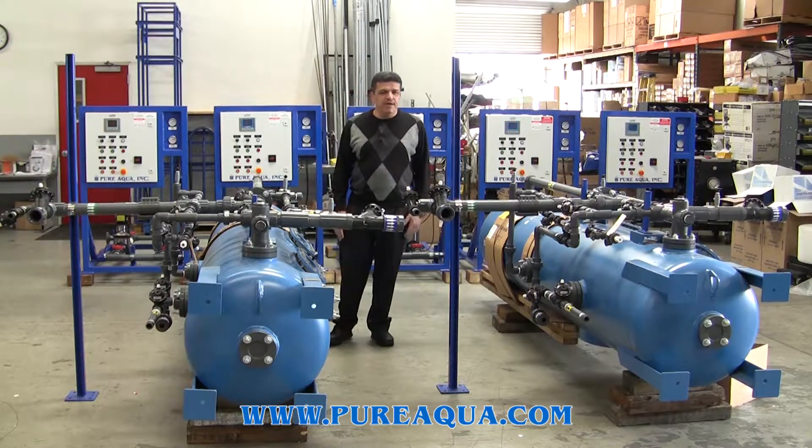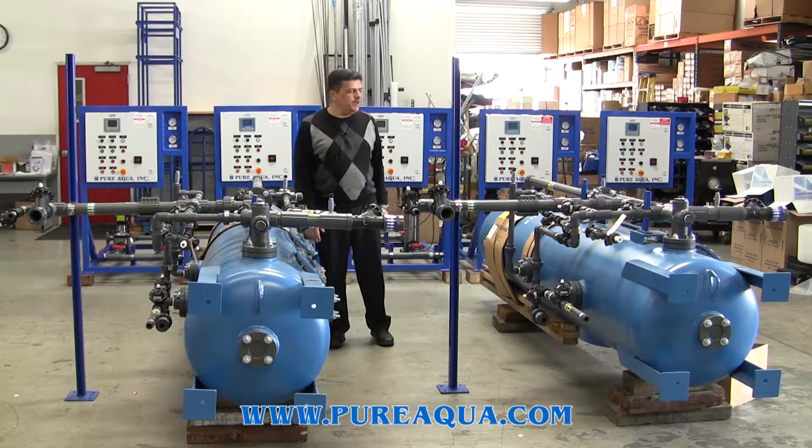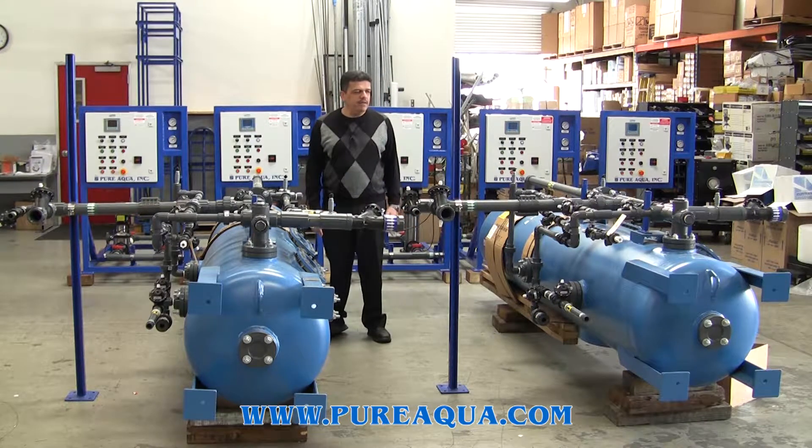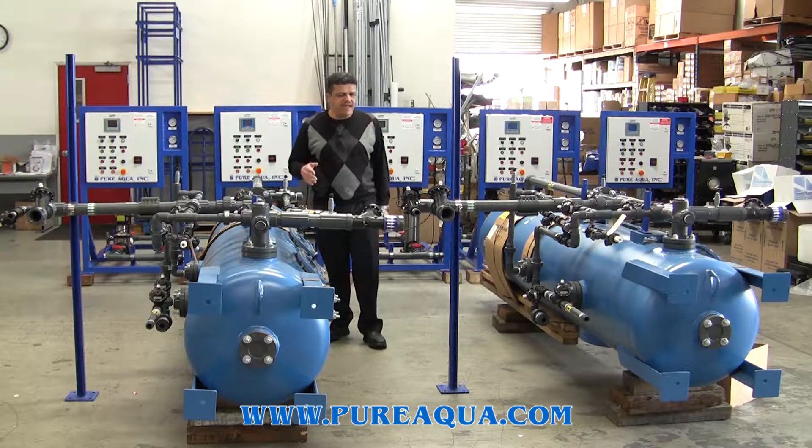We are here to ship a shipment which is going to Kuwait today for a major university in Kuwait — a mixed bed deionization system for two different campuses.